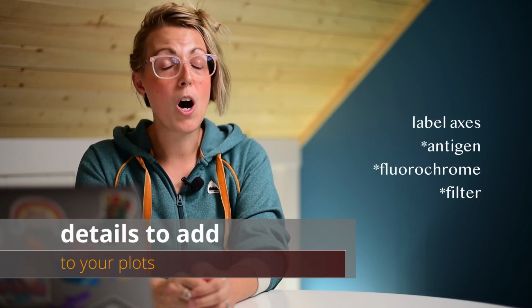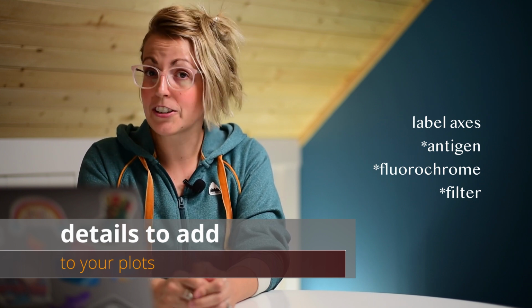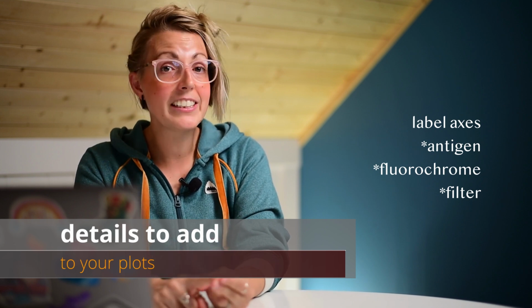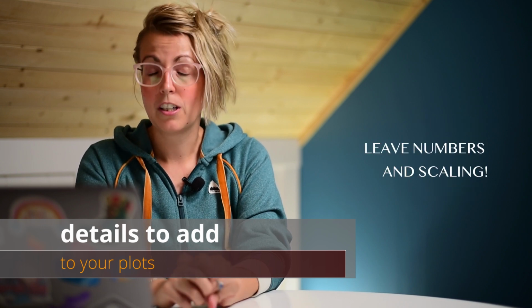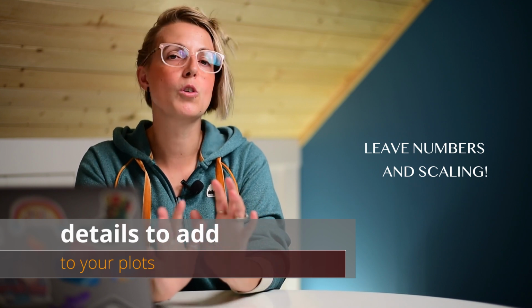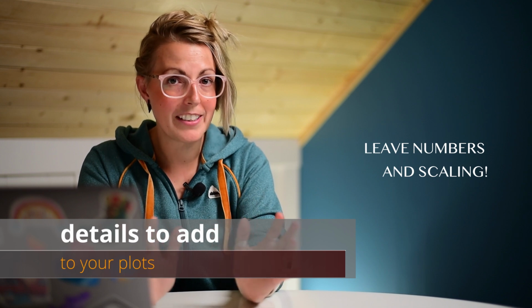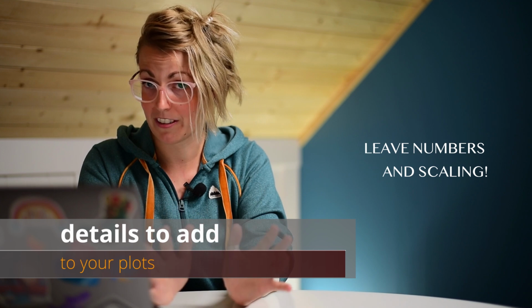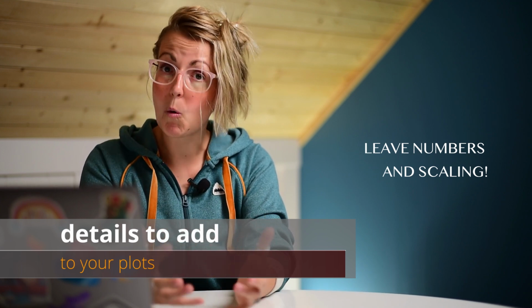First and foremost, always make sure you have your axes labeled. Now these labels shouldn't just be the antigen, they should also be the antigen, fluorochrome, and ideally also the filter used to collect the signal. Next up, do not remove the numbers and the scaling. This is critical. Understanding where your populations are scaled on a plot is important to interpreting the data. So don't remove the numbers.